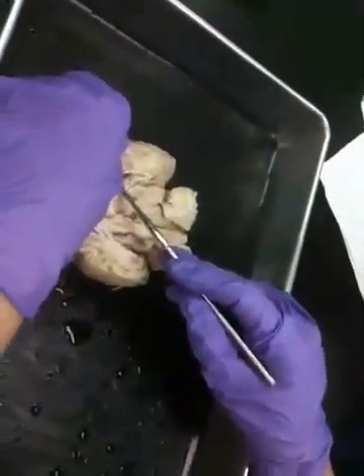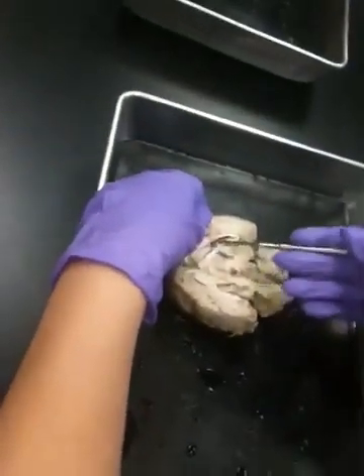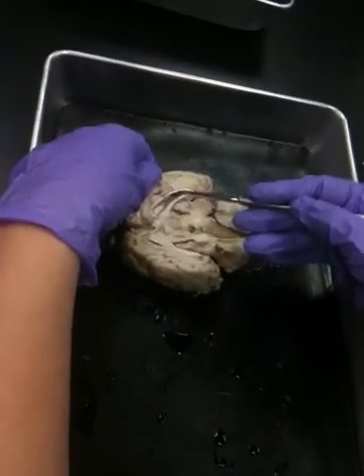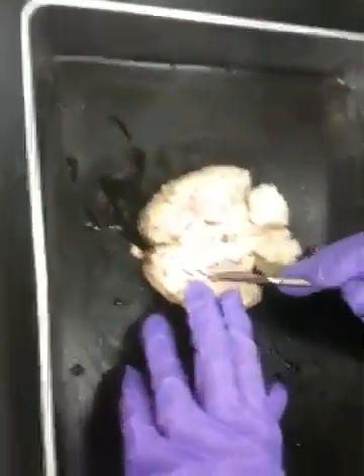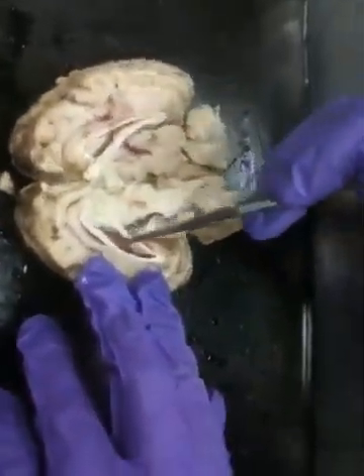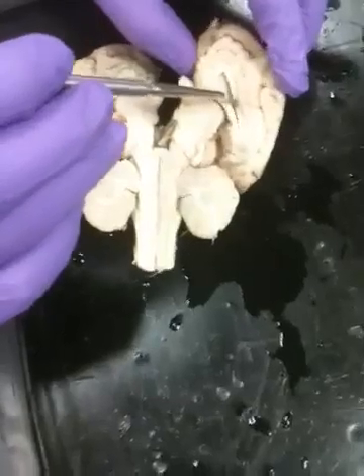So now what we can do is we can actually see into the ventricles. Cool. See how they open up real nicely when we come into here? See that? That's all choroid plexus, some of that is at least, that's producing it. And you can even see some of the septum pellucidum. So you actually did do a pretty good sagittal cut there. You can get that flap, and then you can get down in there. So you can see the lateral ones really nicely on both of them. Okay, so those are lateral. Third, I see it really clearly here. See this space? That's third ventricle.